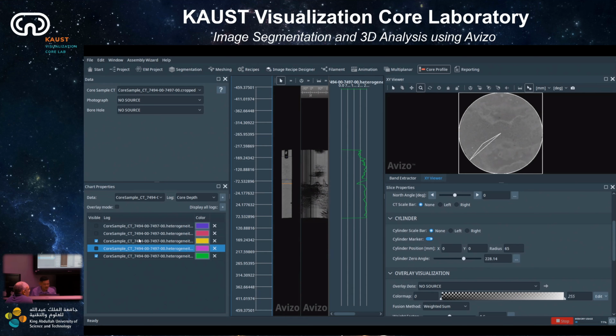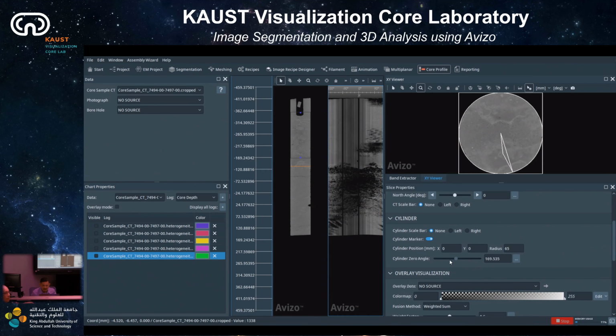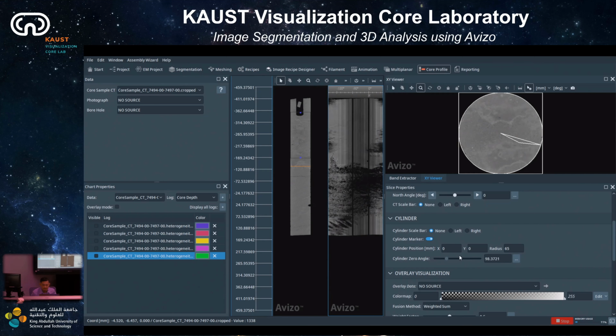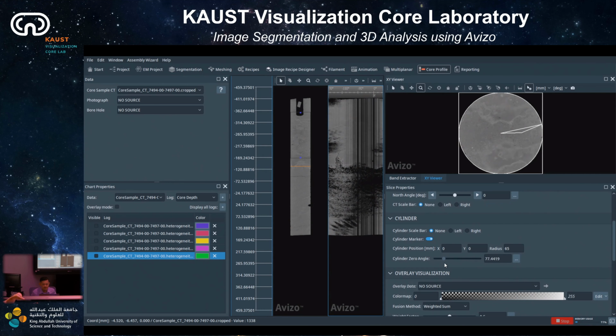Remove lock quickly. No, it's like a projection from the outside, like the borehole image. Yeah. So if I go, for example, like here, you will see. Exactly.